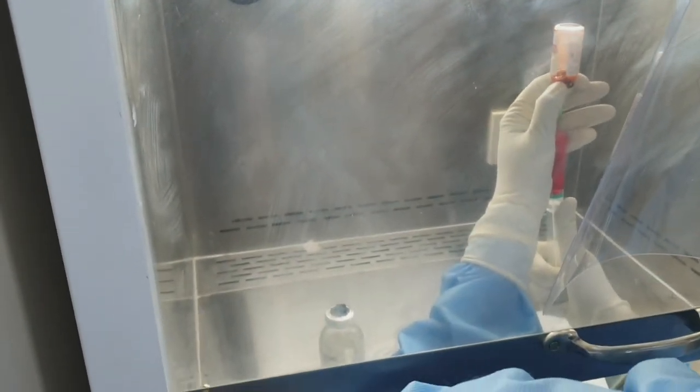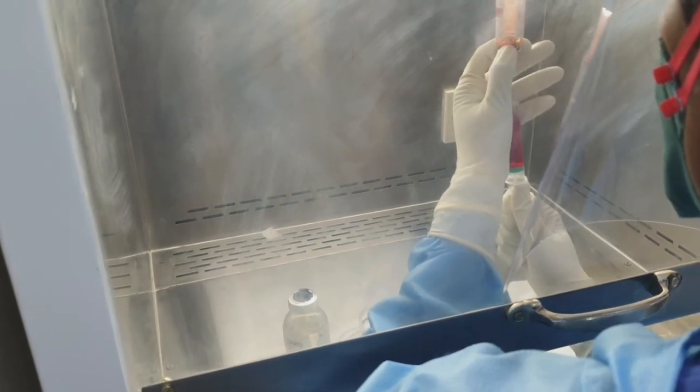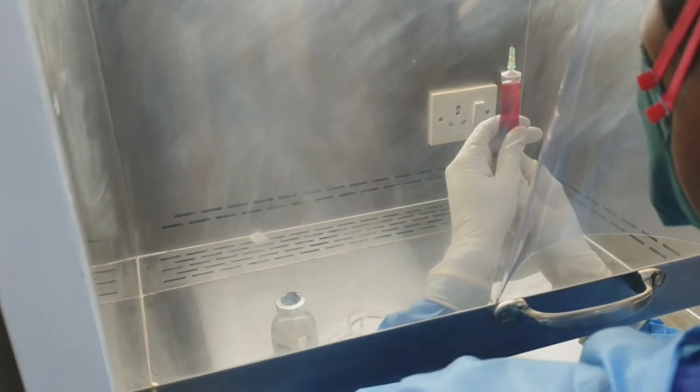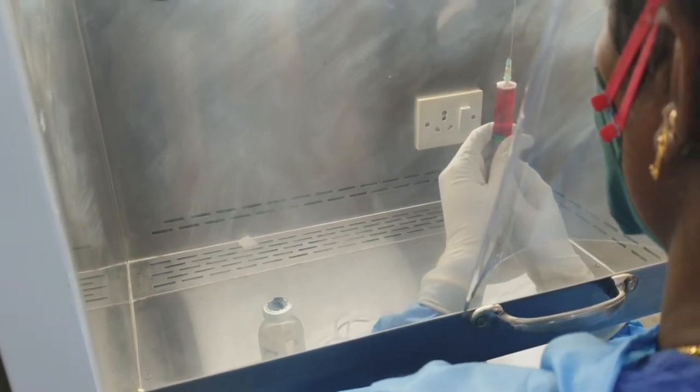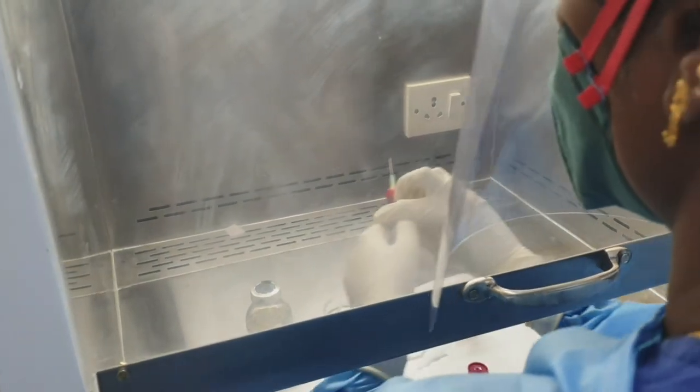She is currently taking the dose of Daunorubicin into the syringe. The Daunorubicin is injected into the IV bag.